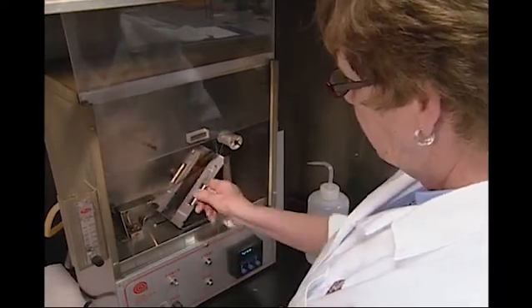The fan is turned on after a test is complete to remove any fumes that occur.